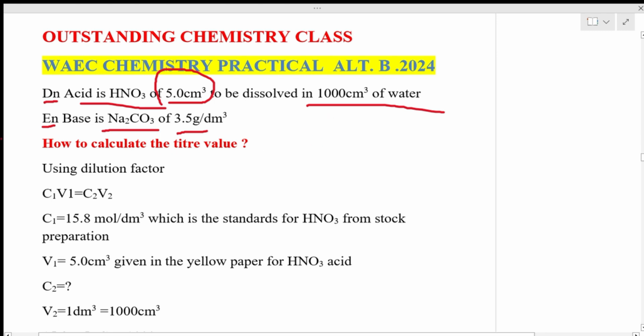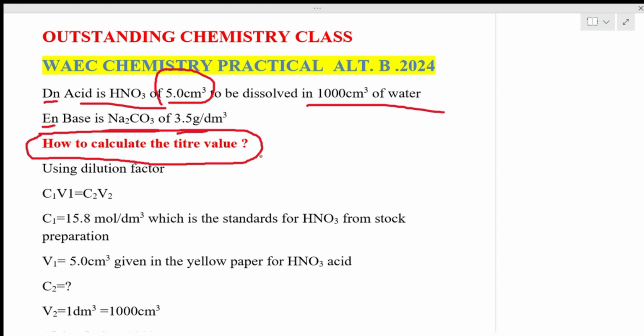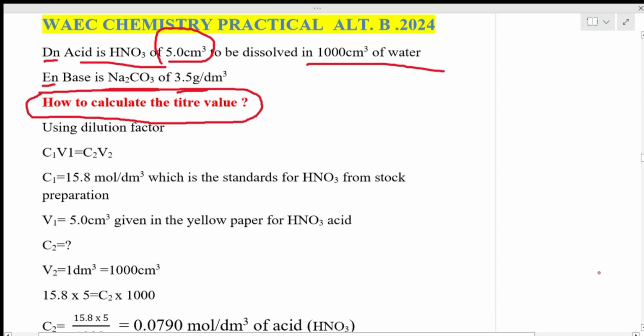For tutors and teachers preparing students for this particular examination, you need to have a range of the expected titration value, and that's why I've taken time to explain and show how to arrive at a calculated titre value for this particular experiment. Okay, let's use the dilution factor.